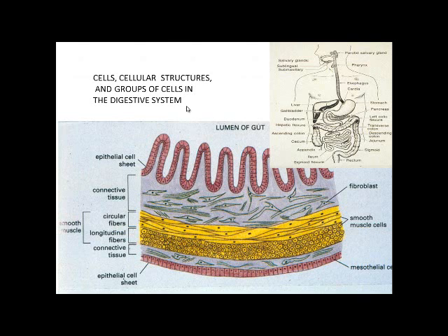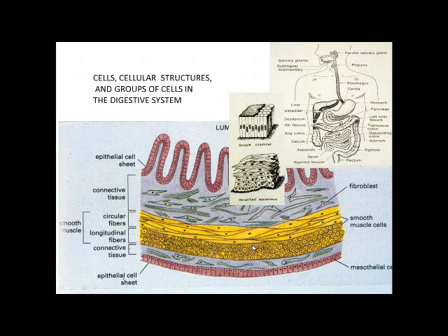And so we have epithelial cells at the surface, and also we have epithelial cells lining the outside of the gut to facilitate the gut movement. There's also smooth muscle cells in through there, the connective tissue cells, and there'll be some nerve cells, as we will see as we come along.